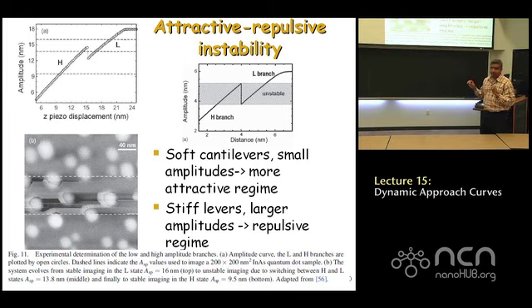So at some point, when you stare at these things enough and you understand cantilever dynamics enough, you look at this image, you don't look at these images as images. You literally see the Z moving up and down and the cantilever oscillating. I mean, at some point, you won't look at these as images. You'll start imagining what the probe is really doing.